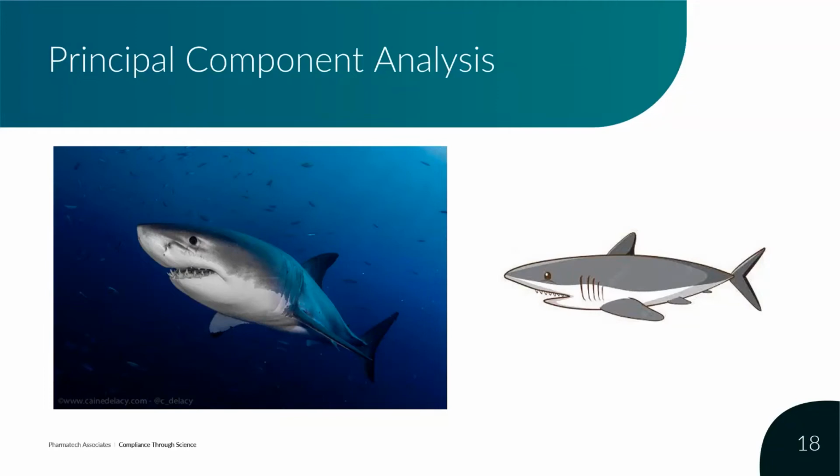And in a similar manner, partial least squares, which is kind of an extension of principal component analysis, works in a very similar manner. Everybody uses ordinary least squares when you're doing something like linearity, or where you only have a couple of variables that aren't collinear. But as is often the case with these sort of advanced methods, collinearity is an issue that you need to overcome. In fact, it can be common.